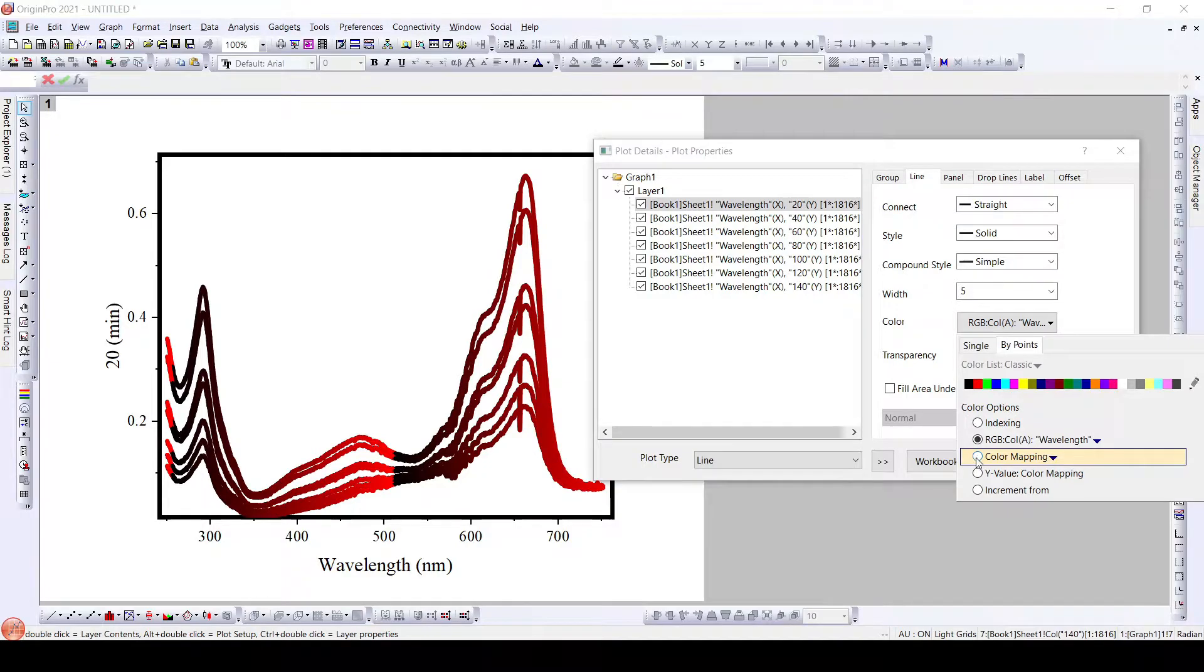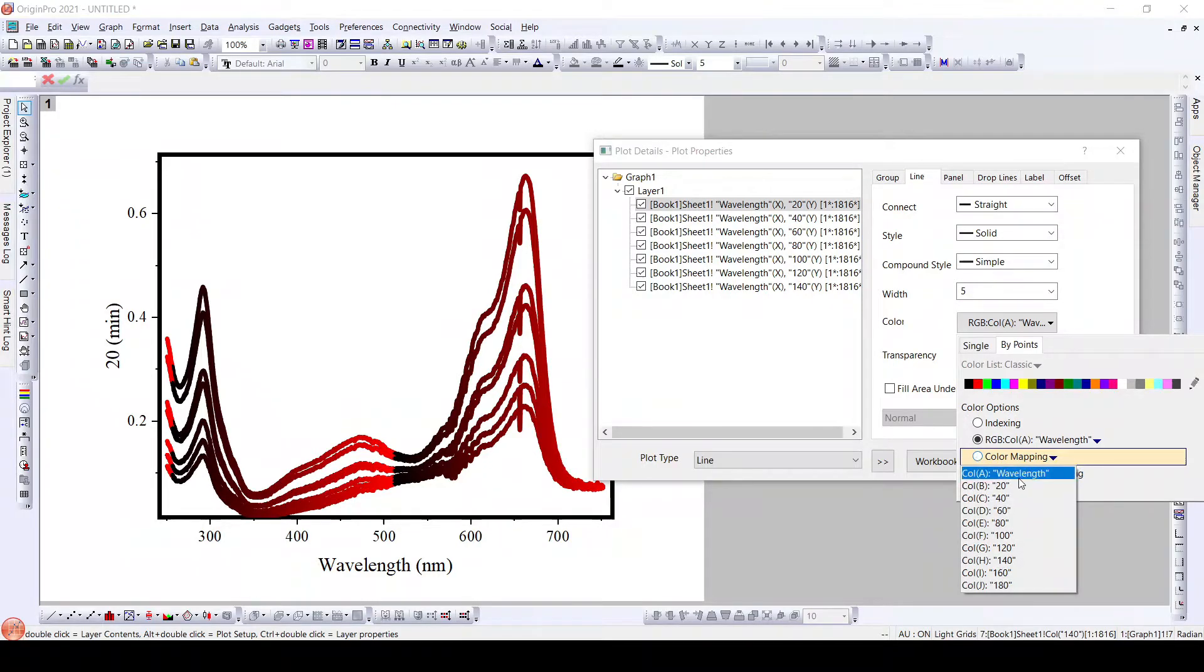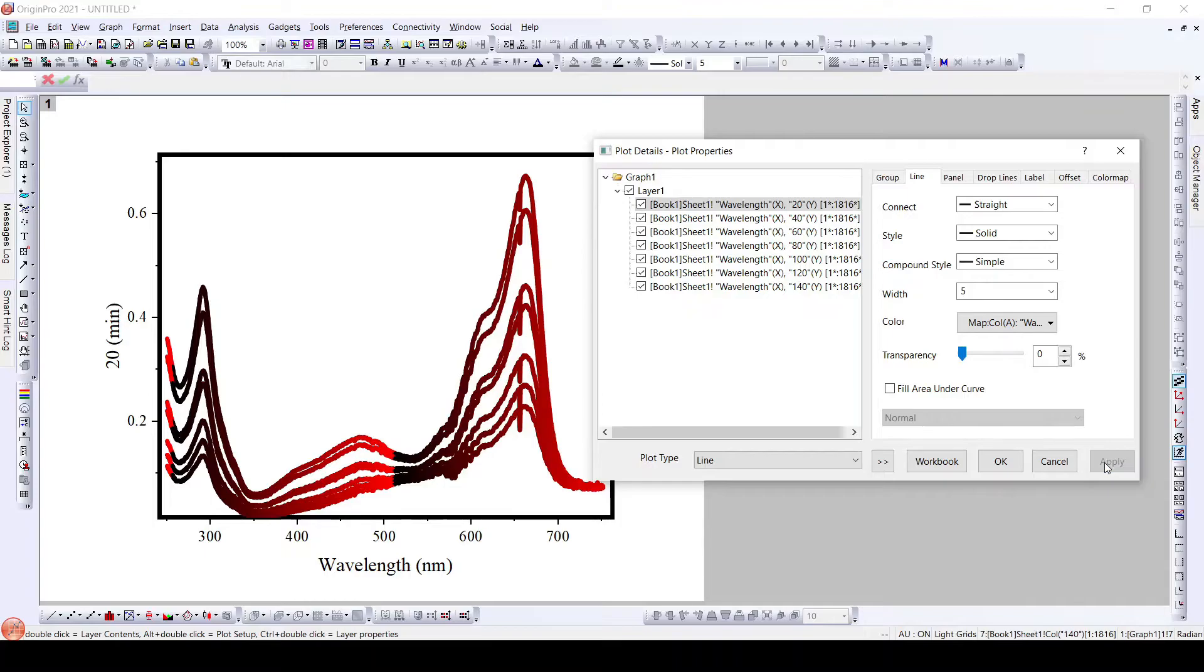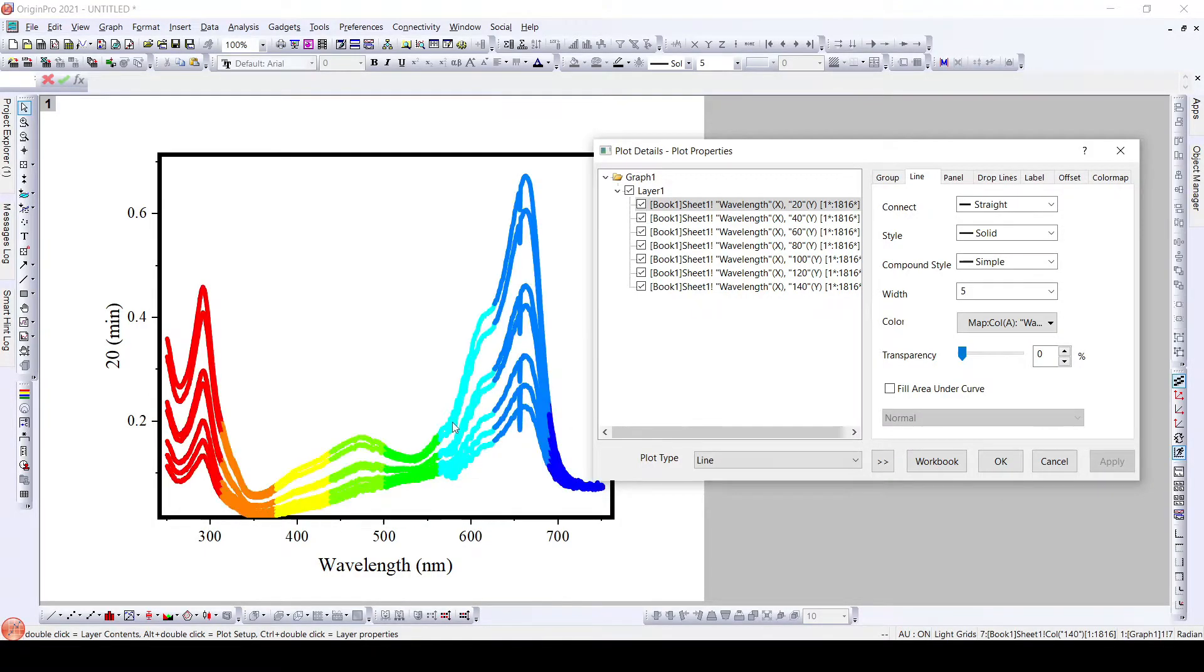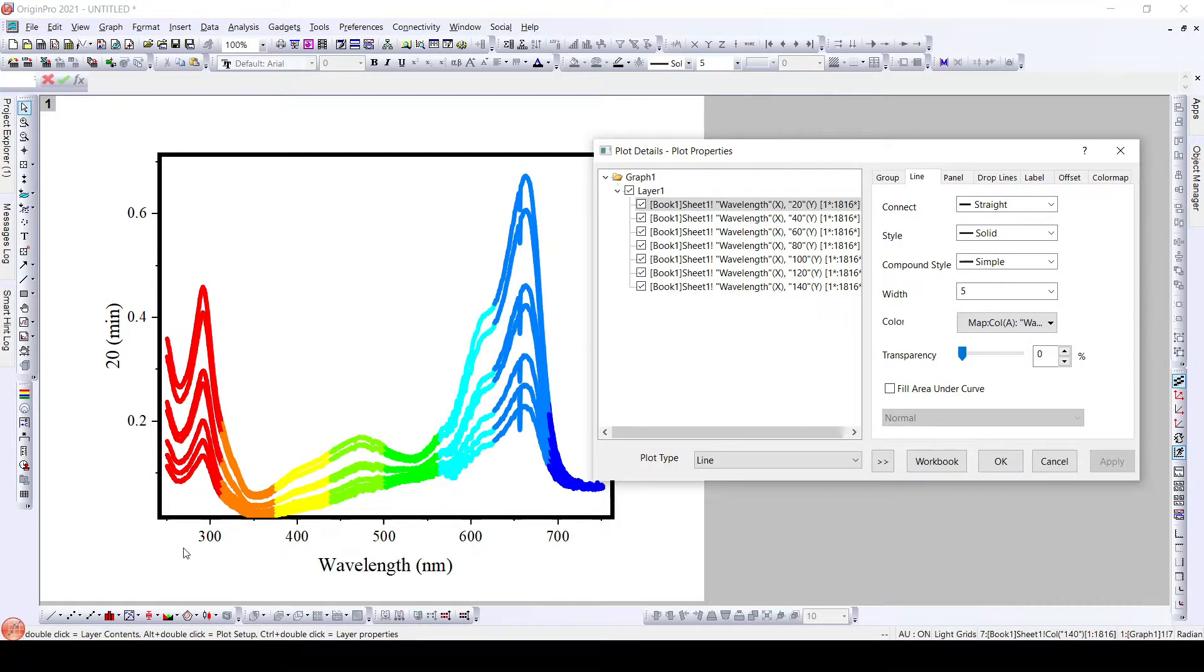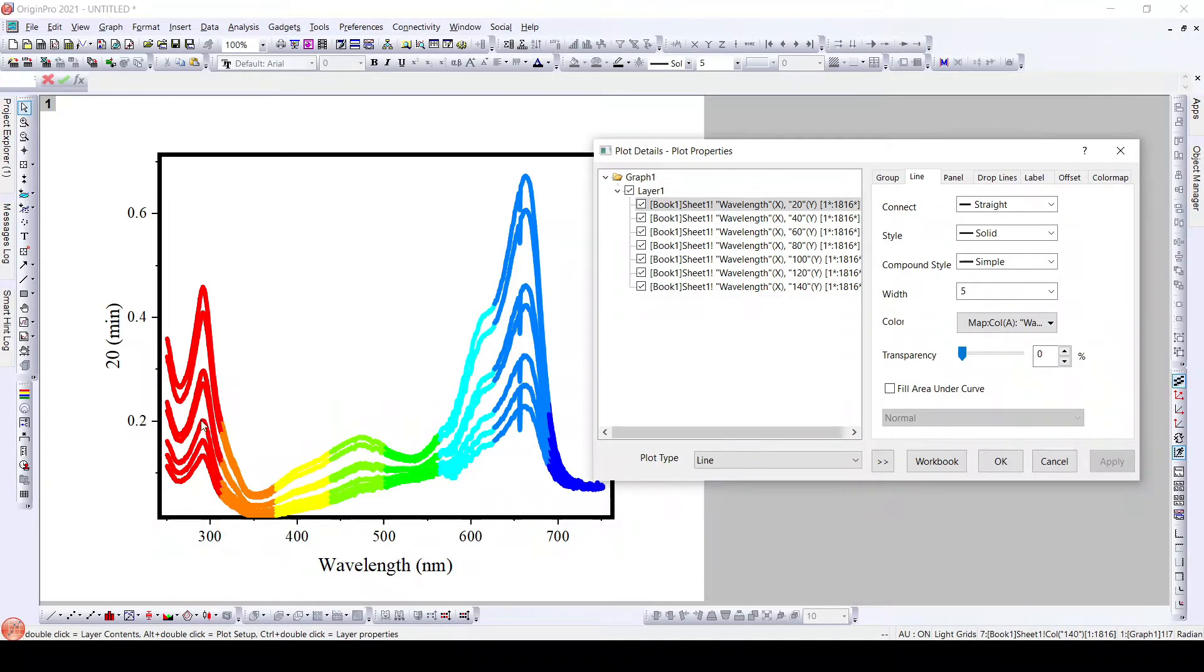Further, what we have is we have color mapping based on wavelength. Once we select this, we can see here we have got sections which are divided based on the wavelength. Certain wavelengths are colored with red.